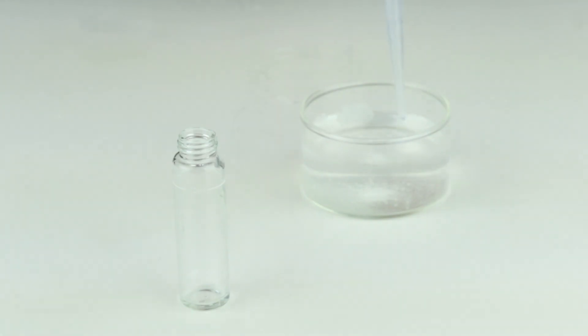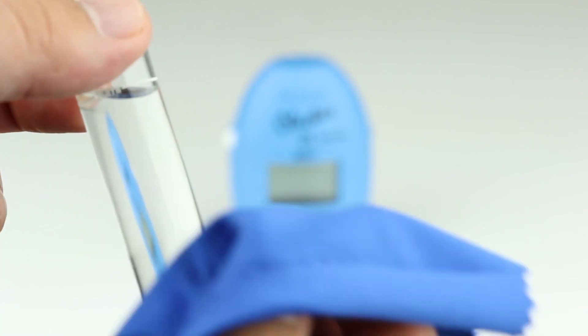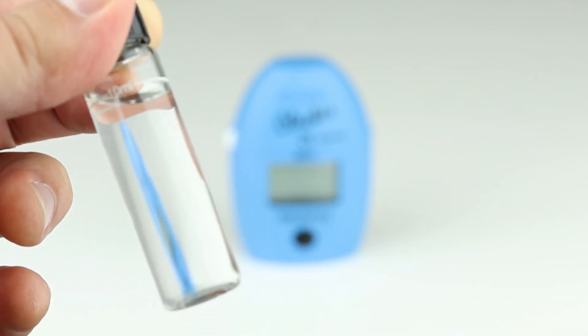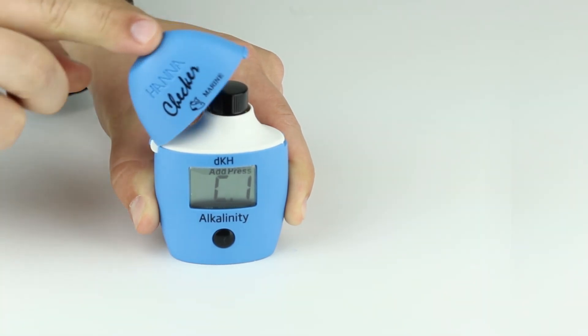Fill the cuvette to the 10 ml line with sample and fasten the cap. Using a microfiber cloth, wipe the cuvette to remove any oils or fingerprints from the glass. Then place the cuvette into the checker and close the lid, making sure it's completely closed.